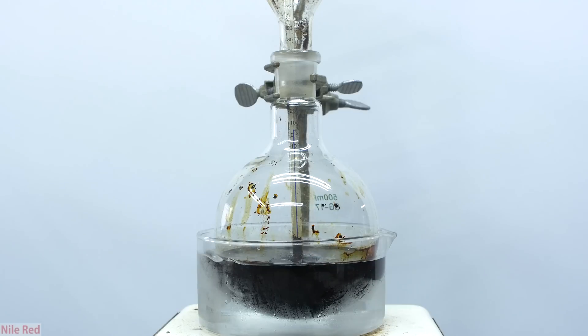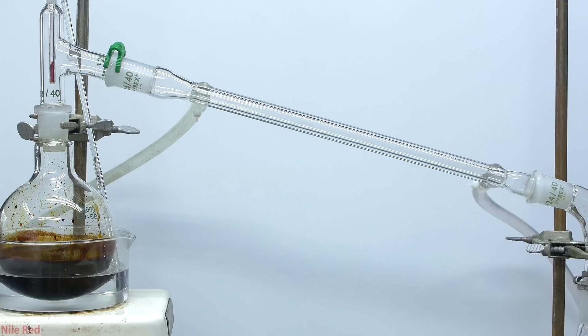Once all the red phosphorus has been added, we let it stir for a little bit and set up a simple distillation apparatus. Here's our simple distillation apparatus, and to heat things we use a hot water bath which is heated to around 70°C.